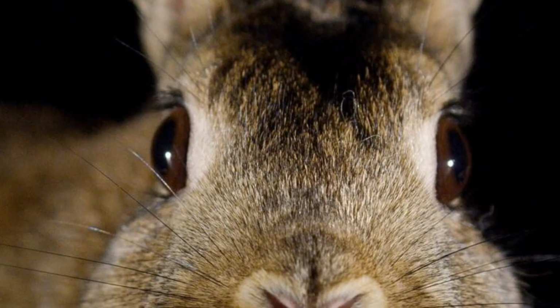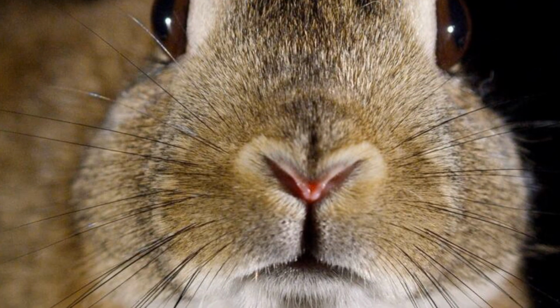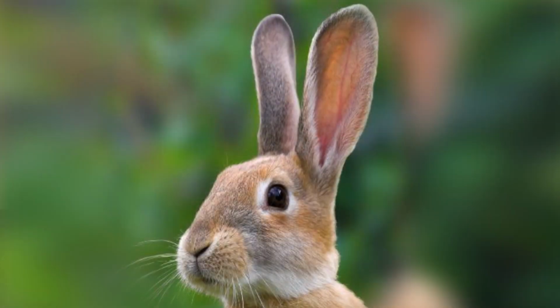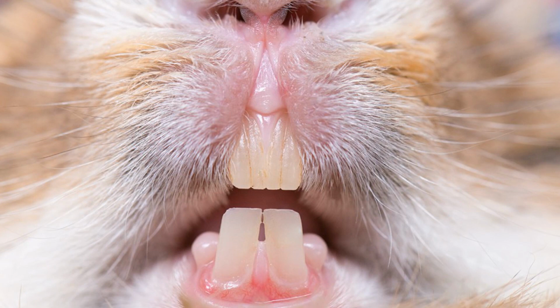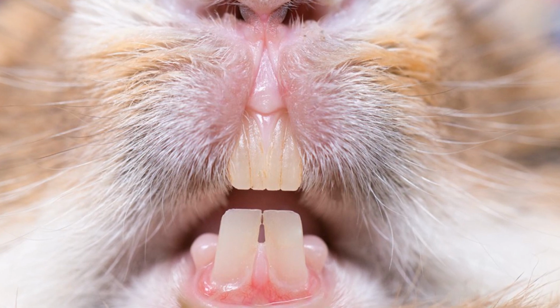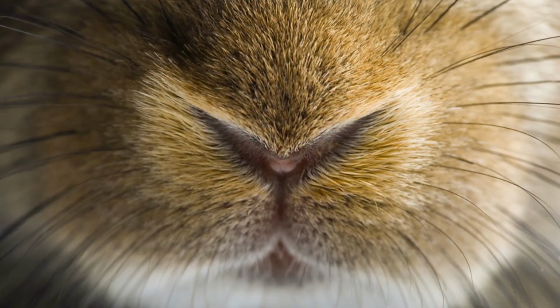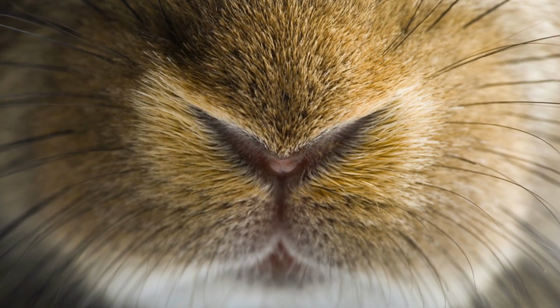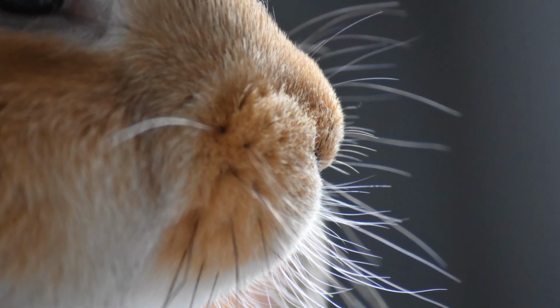The head is pear-shaped with a blunt snout. Anteriorly, it bears a mouth and a pair of external ears, the pinna. The upper lip has a median cleft through which the incisor teeth get exposed. Few prominent and stiff hairs are present laterally on the upper lip. These are touch-sensitive, tactile, and called vibrissae or whiskers.